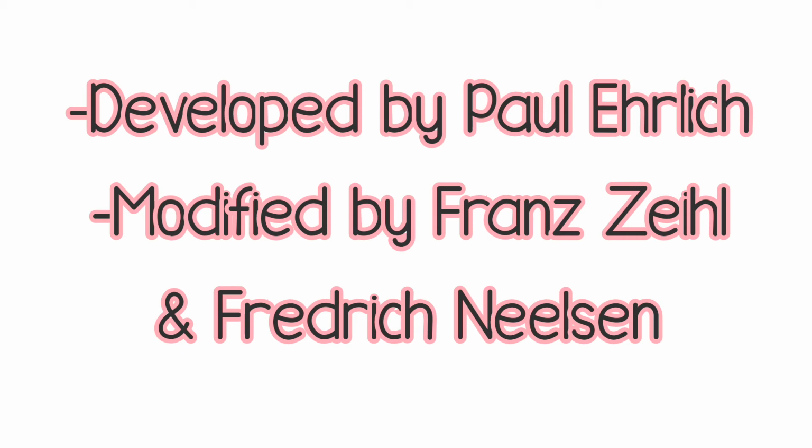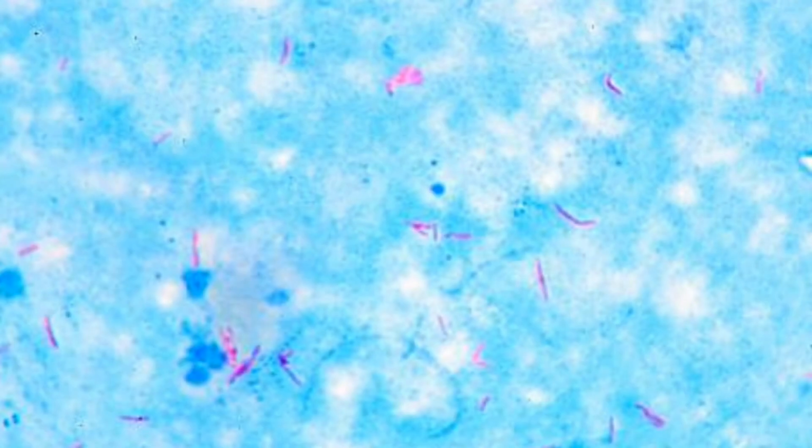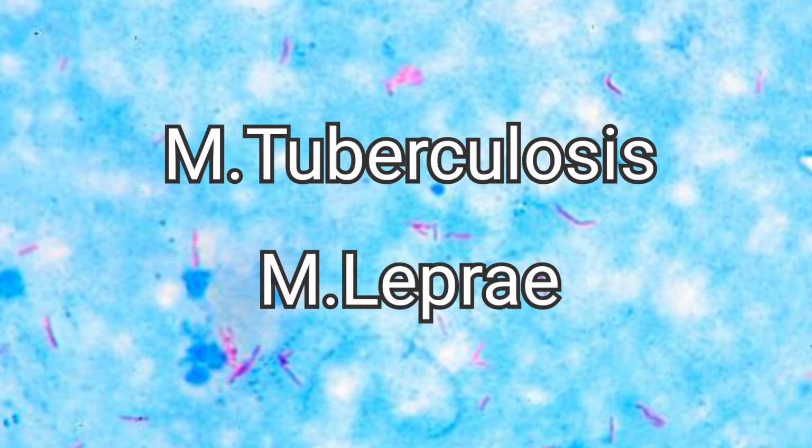So this method was originally developed by Paul Ehrlich, and the modified version is known as the Ziehl-Neelsen staining. It is most commonly used to identify the members of Mycobacterium, especially Mycobacterium tuberculosis and Mycobacterium leprae, the pathogens which are responsible for tuberculosis and leprosy, respectively.